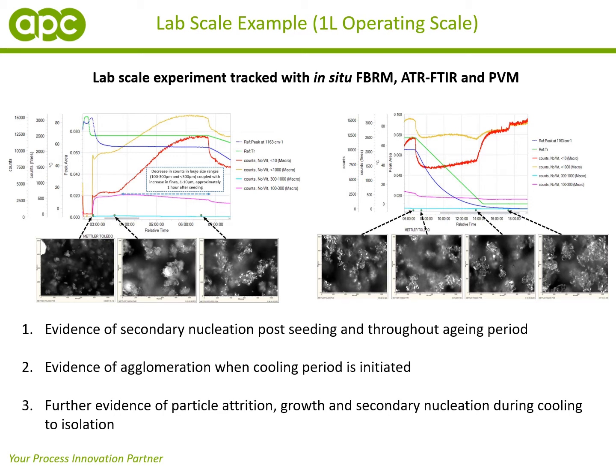Throughout the process run, the IR, which is indicated in the blue trace, is tracking the desaturation rate pretty effectively. So you can see post-seeding, it desaturates and reaches a plateau, which then starts decreasing once more during the cooling portion of the experiment, again being tracked very effectively all the way to the isolation temperature.